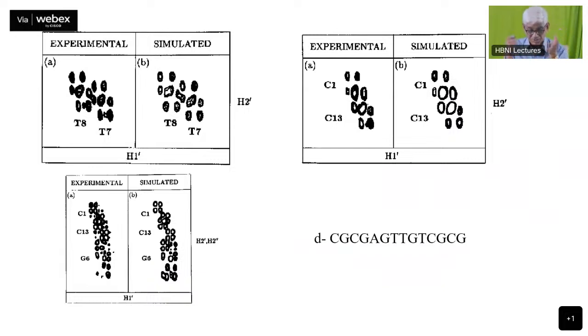So I've just shown you the simulation. In fact, this is work from our own lab, in this large molecule. You can see the beautiful simulation which is matching almost entirely. Even in a complex structure like this, you can simulate it and match the individual peak patterns.